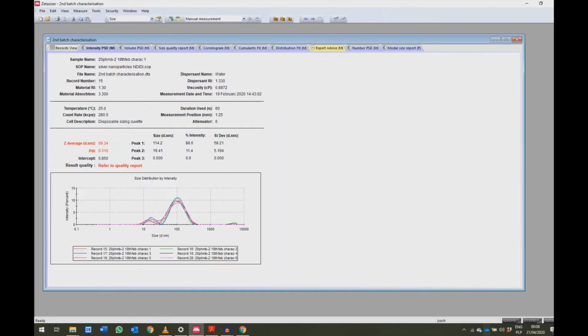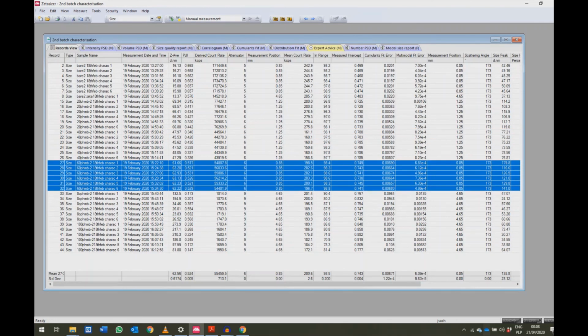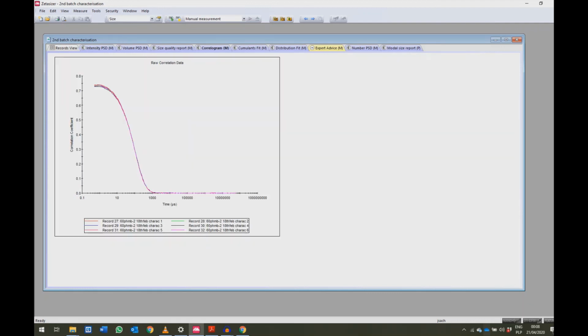This is a little bit more difficult around there as well, but the quality of data might be good enough. And here again, how good is this data? There is something happening here. So the fit here, the overlap here is very good, but the overlap here, there's something happening, and it could be an indication of something.